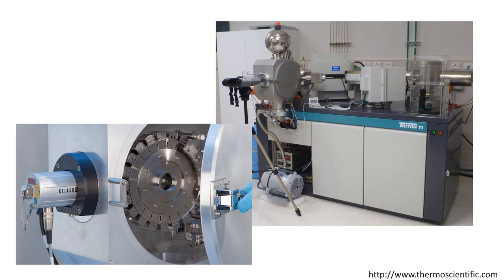And this is an example of one of the latest generation thermal ionization mass spectrometers. You can see here that this is our sample wheel. Each one of these little chambers has a sample dried down onto one of these very, very small filaments. We can then rotate this into position over here. And then when we're ready to measure that sample, we can accelerate the ions along the flight tube here into the region where the magnet is. And then there's a collector block over here, where we can collect the ions that we've separated out in the magnet.